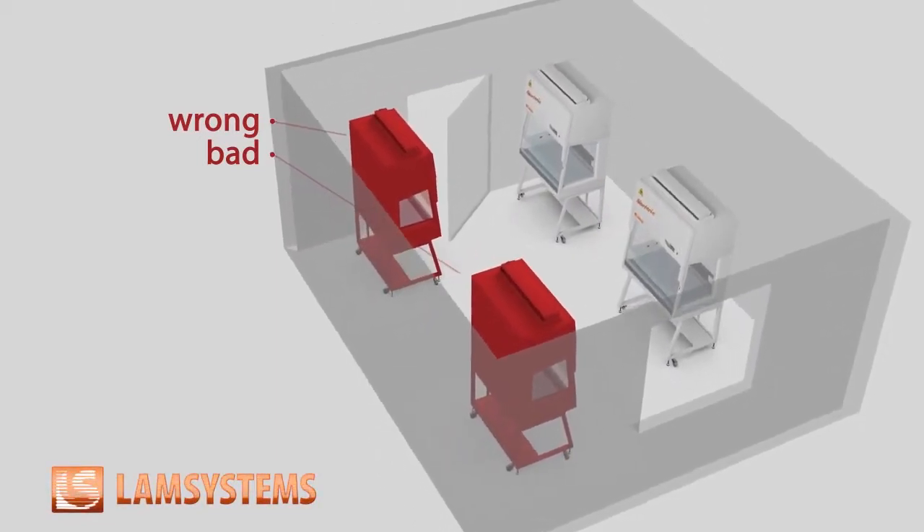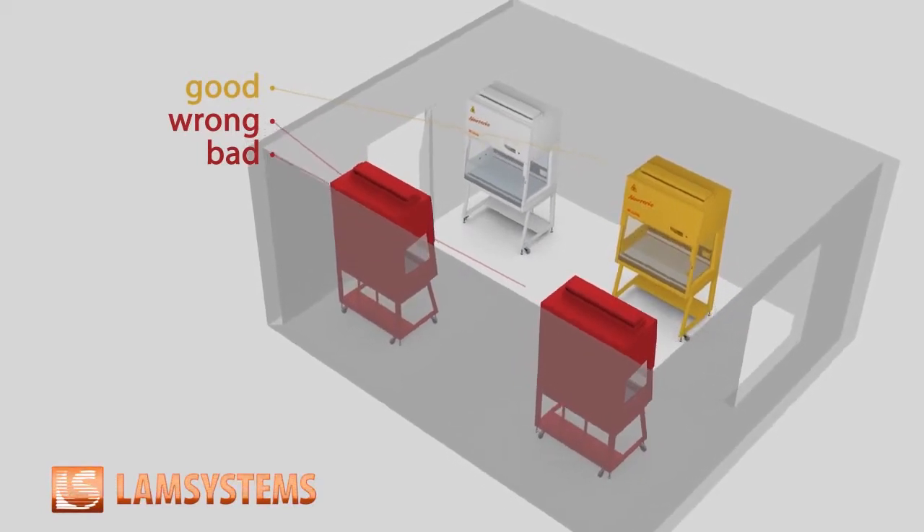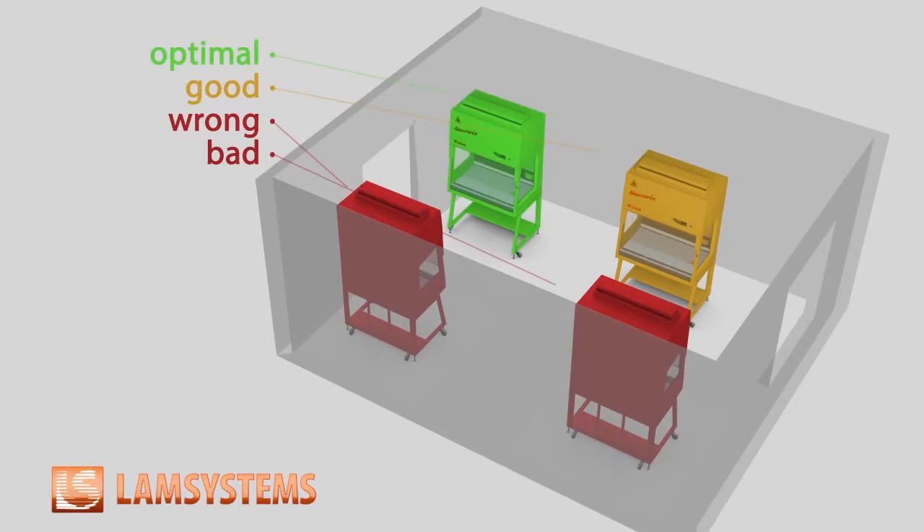Remember that the proper airflow in the operating cabinet can be affected by portable fans, personnel going around, and even another operating cabinet at a close distance.